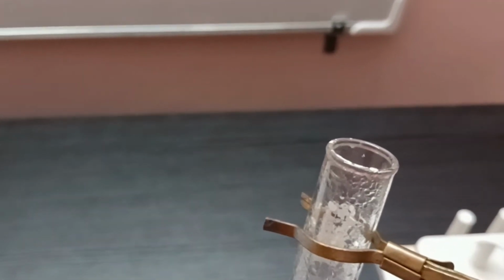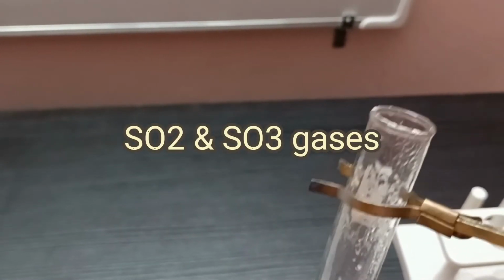Now the decomposition reaction of ferrous sulphate will begin. As the reaction proceeds, you can see the formation of gases. A strong stench is coming, that of burnt sulfur.